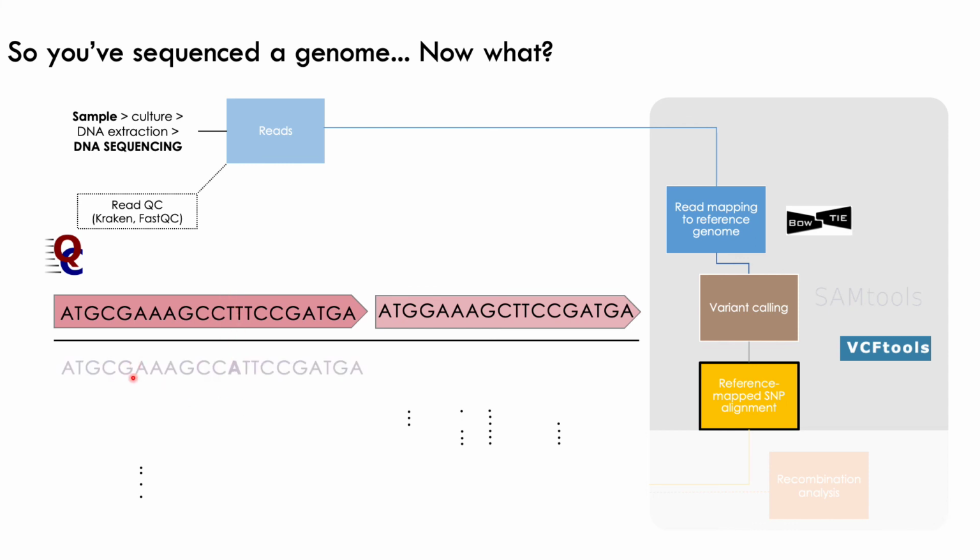We're not going to take this first position that had the error. So we can see that the G remains a G, but at the second position that had a high quality SNP, we've got an A instead of a T. And we can do this for each of the genes or across the whole genome, but just using the genes as examples.